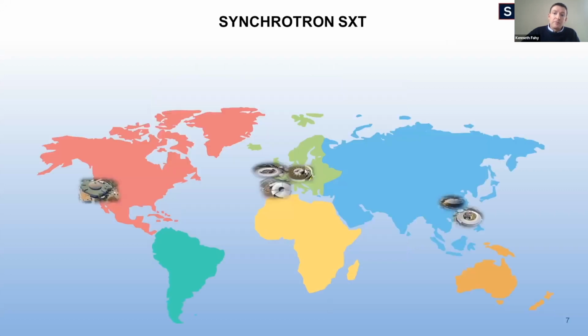Finally, just to put the availability of soft X-ray tomography currently into context, it's currently available at 6 synchrotron beamlines worldwide that are offering soft X-ray imaging in the so-called water window. One of these is based in the US, there are 2 in Asia and 3 in Europe. The utility of the technique has been validated at these beamlines, and there's very much growing interest in the technique. So we believe this is a good time to be rolling out a lab-based version.